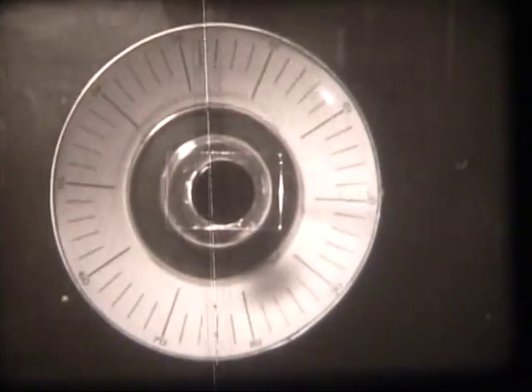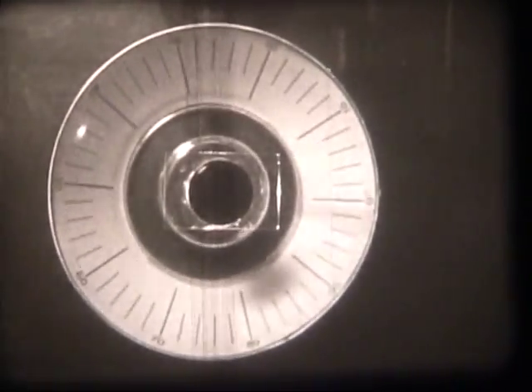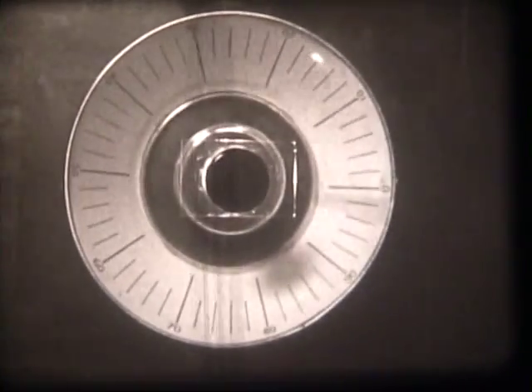As the protoplasm flows up and down the living thread, the mirror on the end of the thread slowly turns and reflects the spot of light. And so we show that all life has a twist in it.